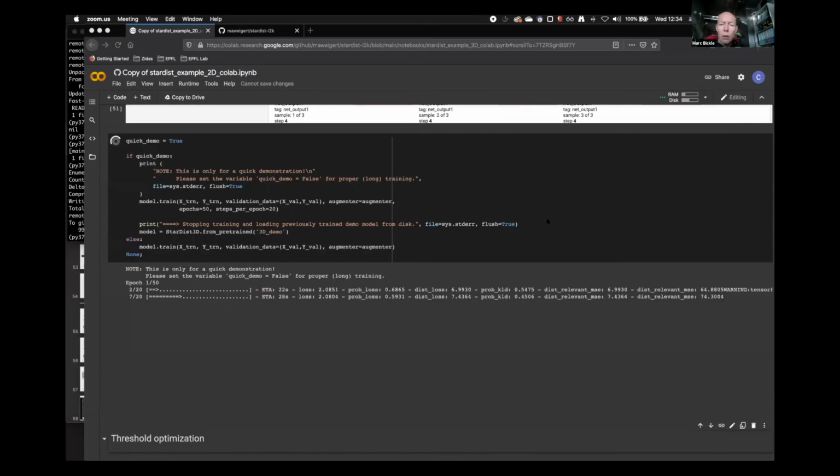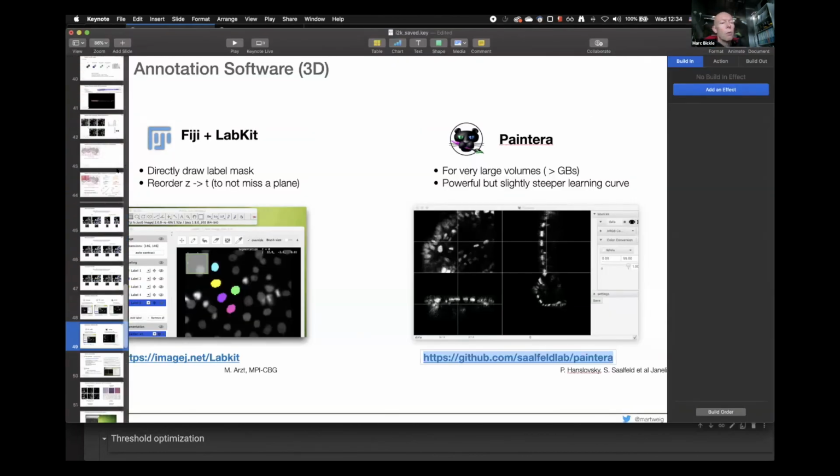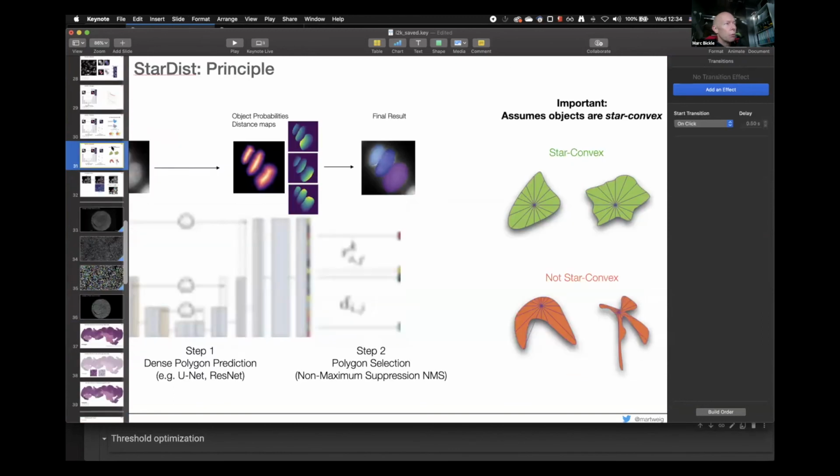You were showing in your presentation earlier these orange cells, which are extremely non-convex, right? Have you tried to pretend it is, with a lot of overlap, so that you're still predicting convex things, and then you're fusing objects which are touching? The bottom right would be all separate. You might then, in a second step, fuse them by allowing a lot of NMS and say there's a lot of stars in there. It's a collection of convex shapes.